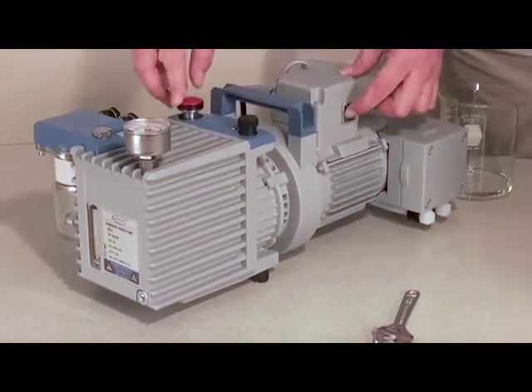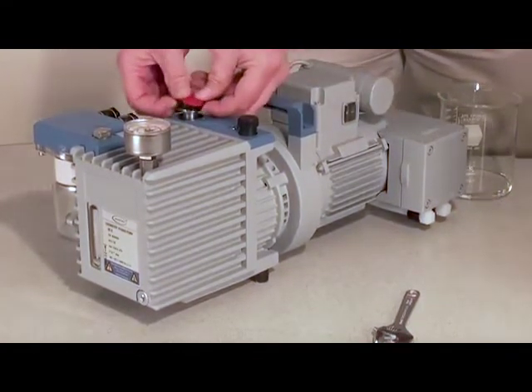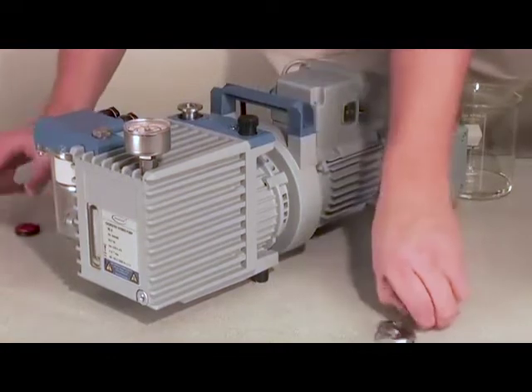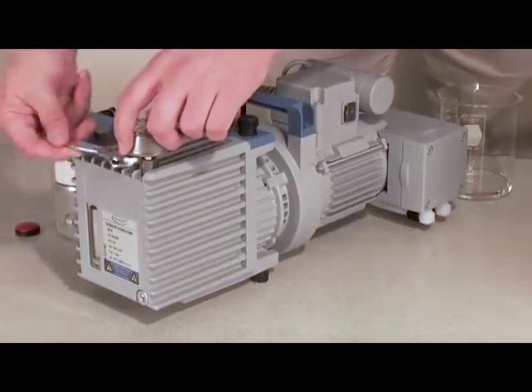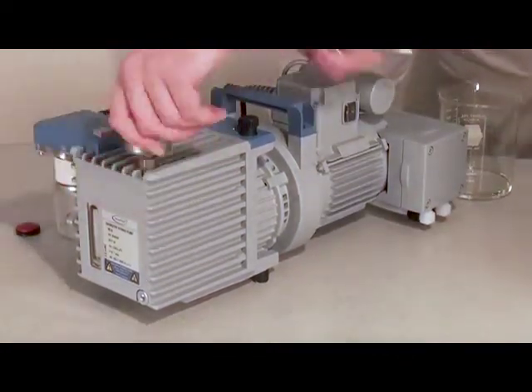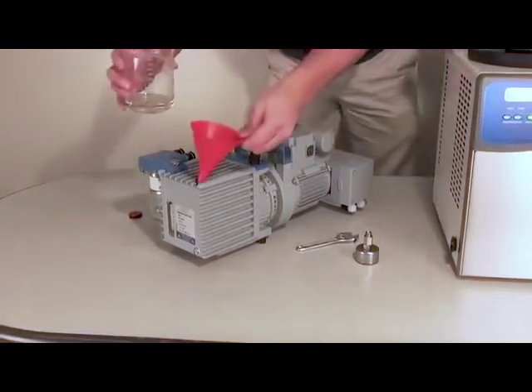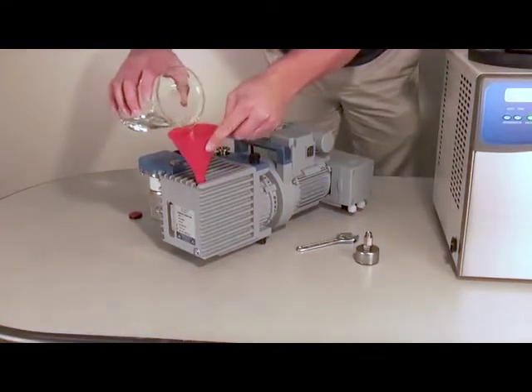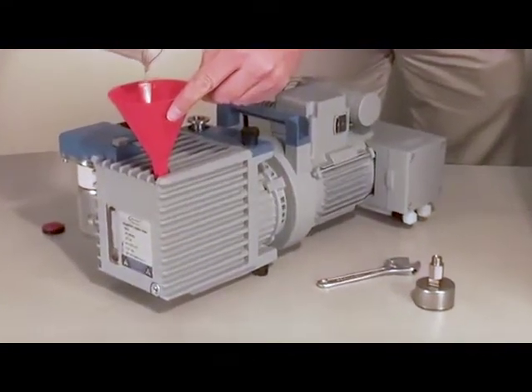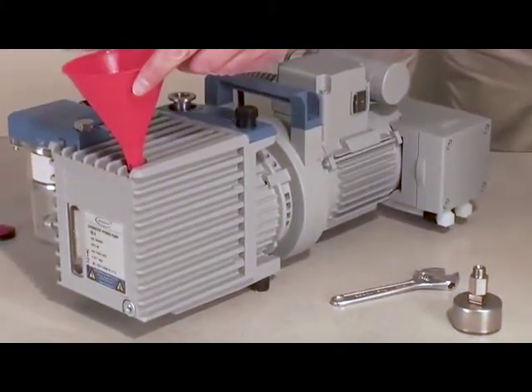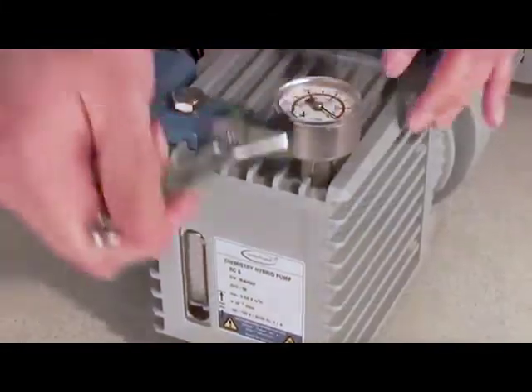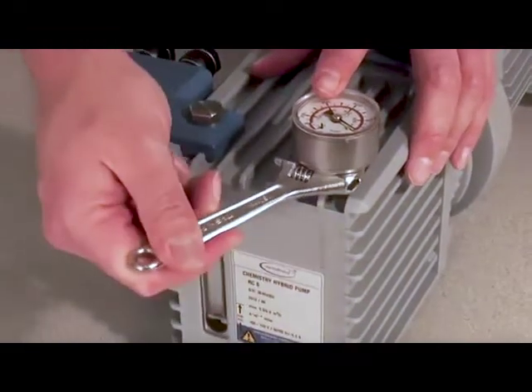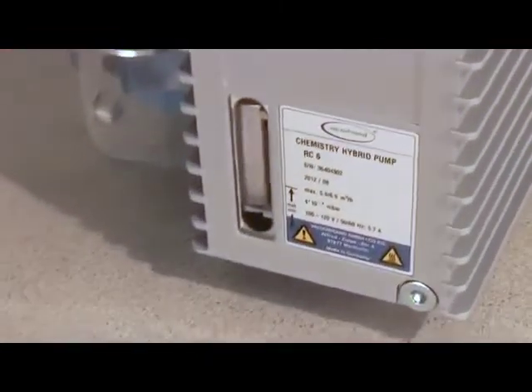After running the pump, turn the pump off and remove the manometer and inlet cap. Add an additional 100 milliliters of oil. Do not overfill the pump. Reinstall the manometer and check the oil level.